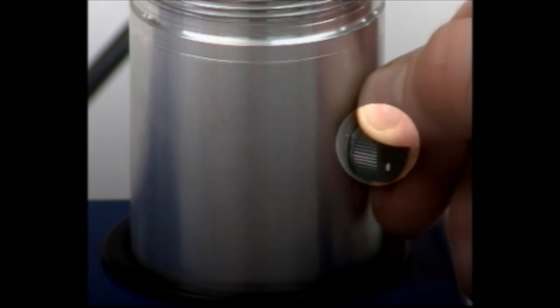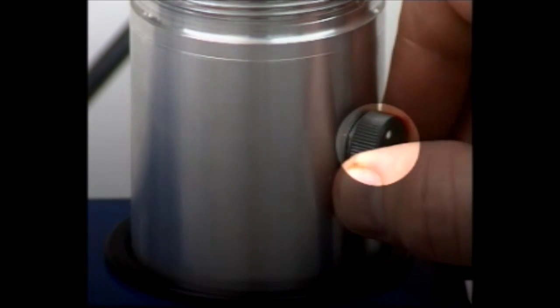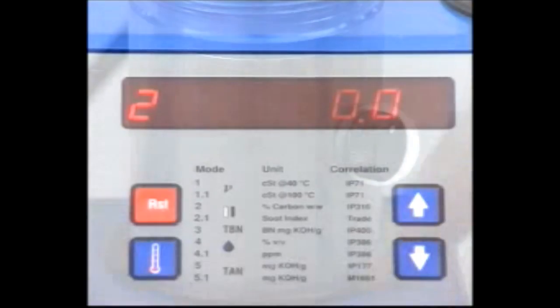Rotate the zero knob on the side of the cell fully anticlockwise, then slowly clockwise until the reading reaches zero.